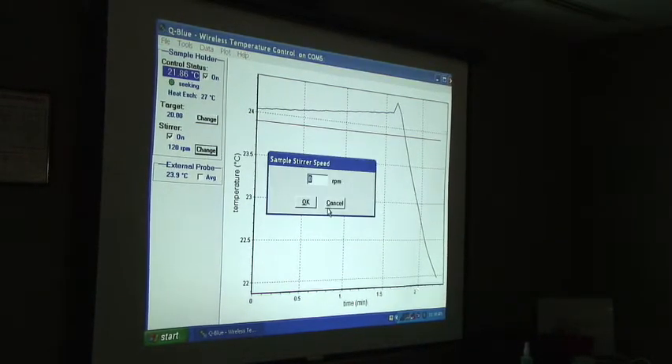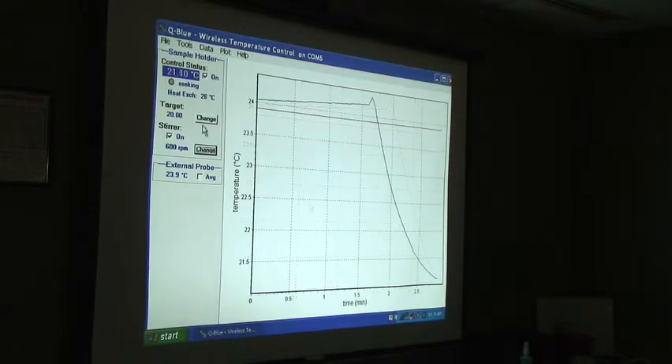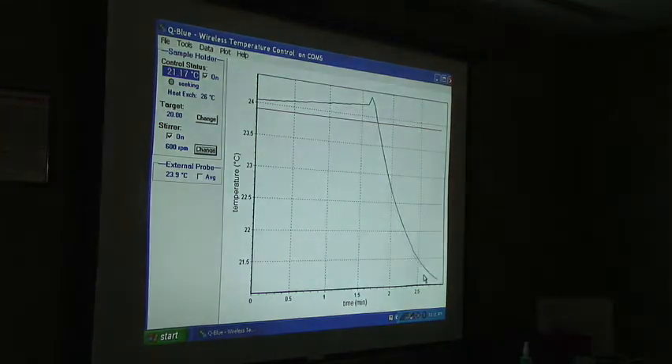Let's say I want it to stir a little bit faster — I can set it to 600 RPM. It is now sinking to 20 degrees.